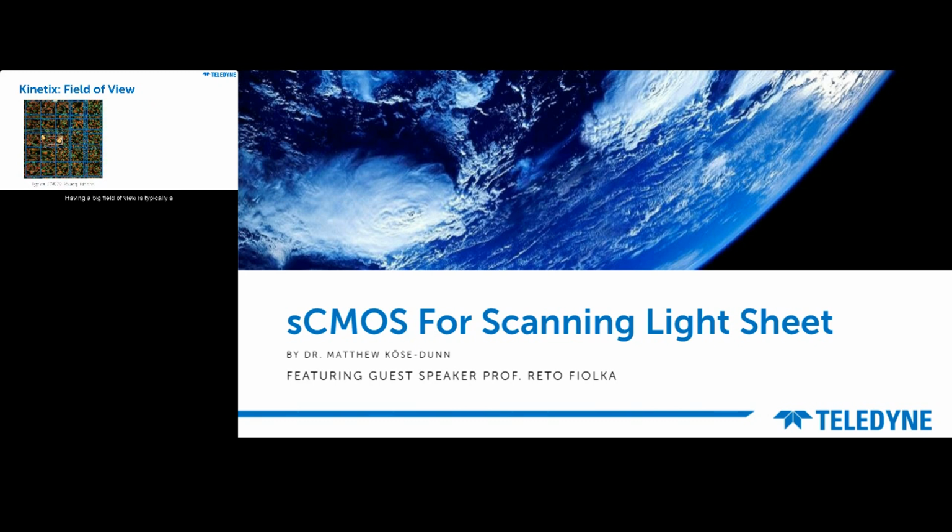Having a big field of view is typically a really big deal for microscopy, however. So in this example, we can see a large tissue sample imaged with a typical CMOS. Each image has 3 different wavelengths and has about a 15% overlap with its preceding image, so there's less tiling artifacts. So this XY scan with the overlap and the 3 wavelengths took 25 acquisitions, and this is going to be a fairly long imaging experiment.